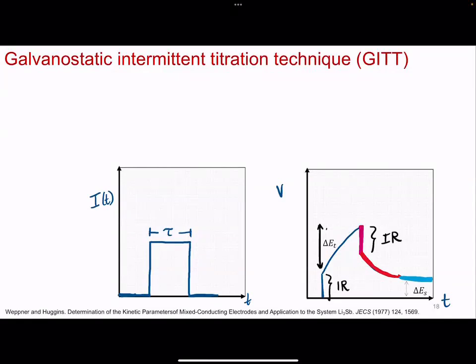So in terms of designing new materials, one needs to understand how current and older, more conventional materials behave. And even then, I should emphasize, this is a model. Interpreting the data that comes out of GITT requires fitting, requires modeling, requires understanding the crystal structure.